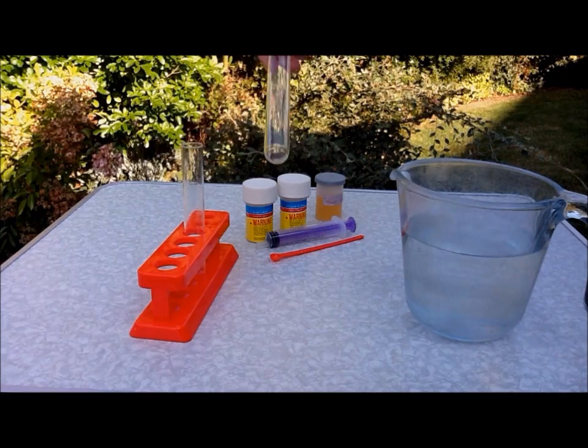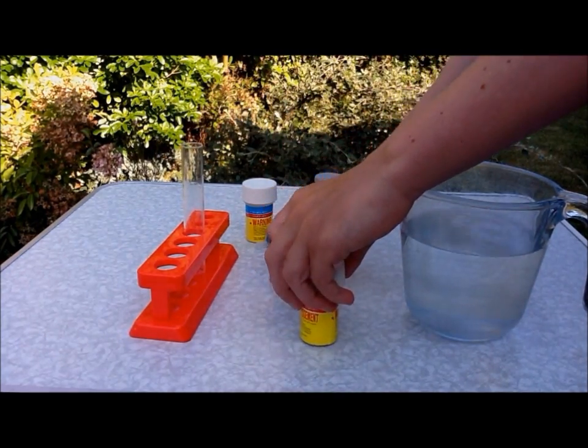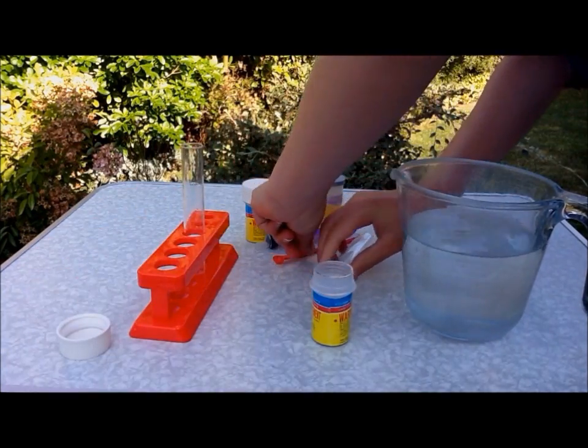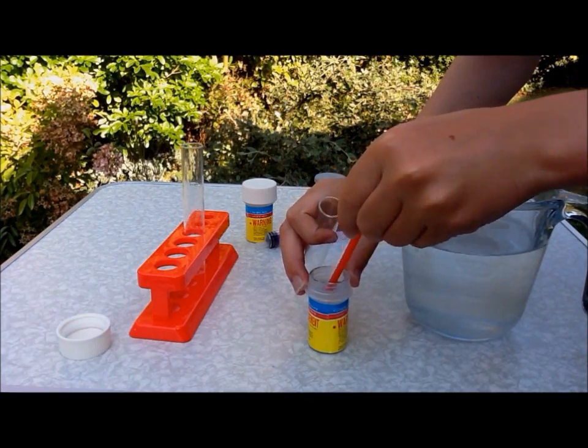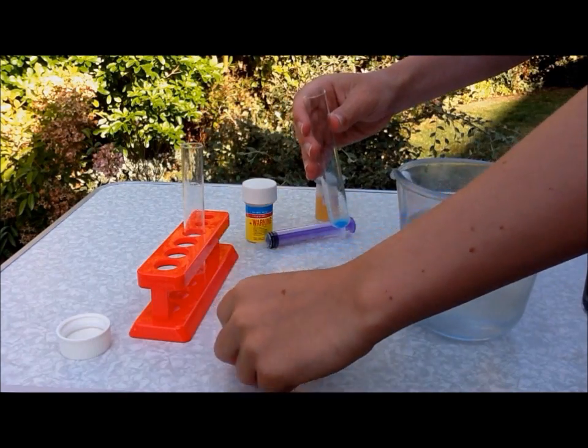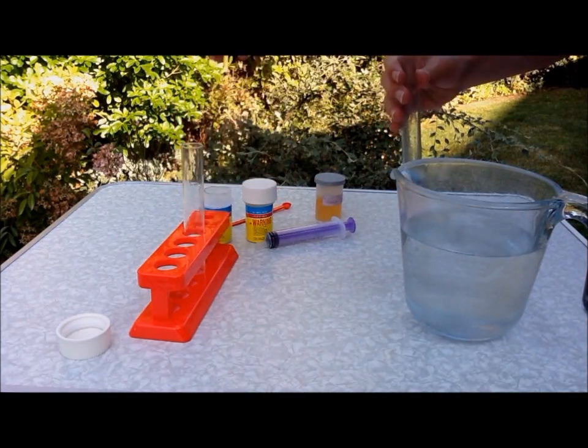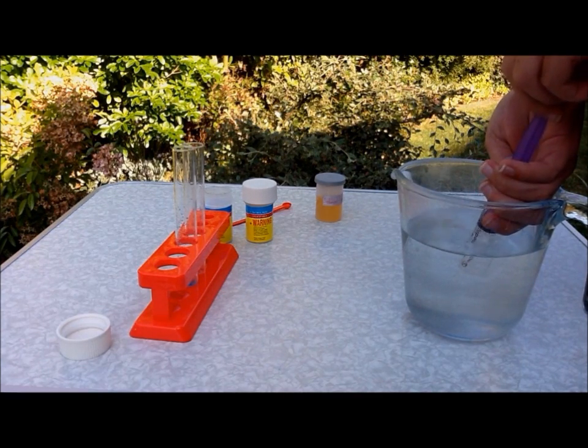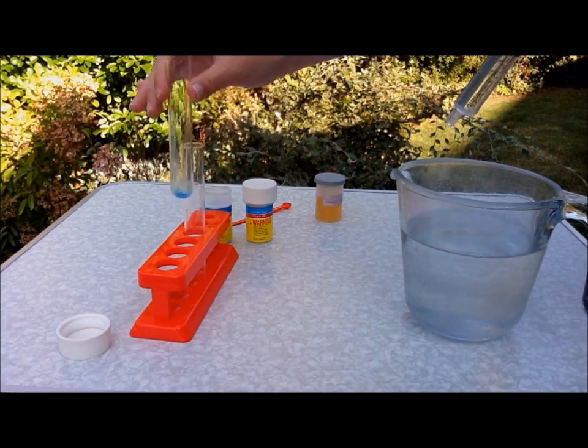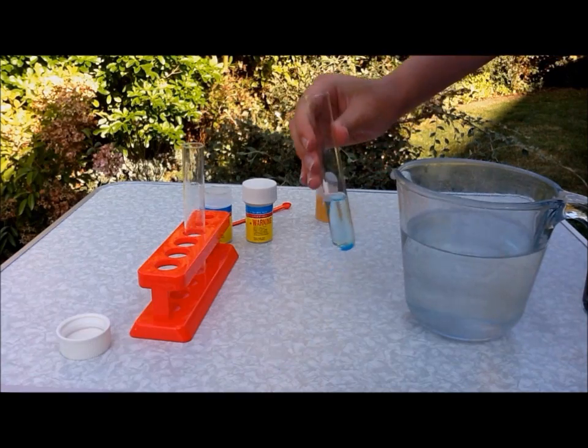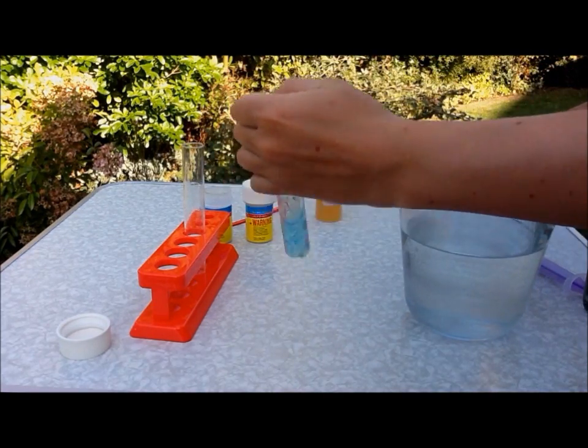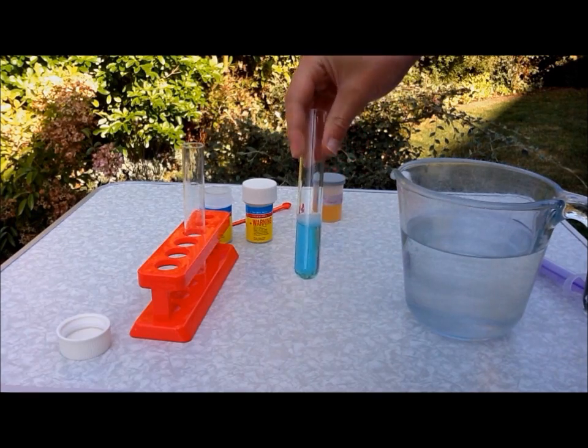So in your first test tube, you will need to get your copper sulphate and put about 0.3g in the test tube and dissolve that in 8ml of water. And then give it a swirl to dissolve and if necessary shake it. It should be a blue solution.